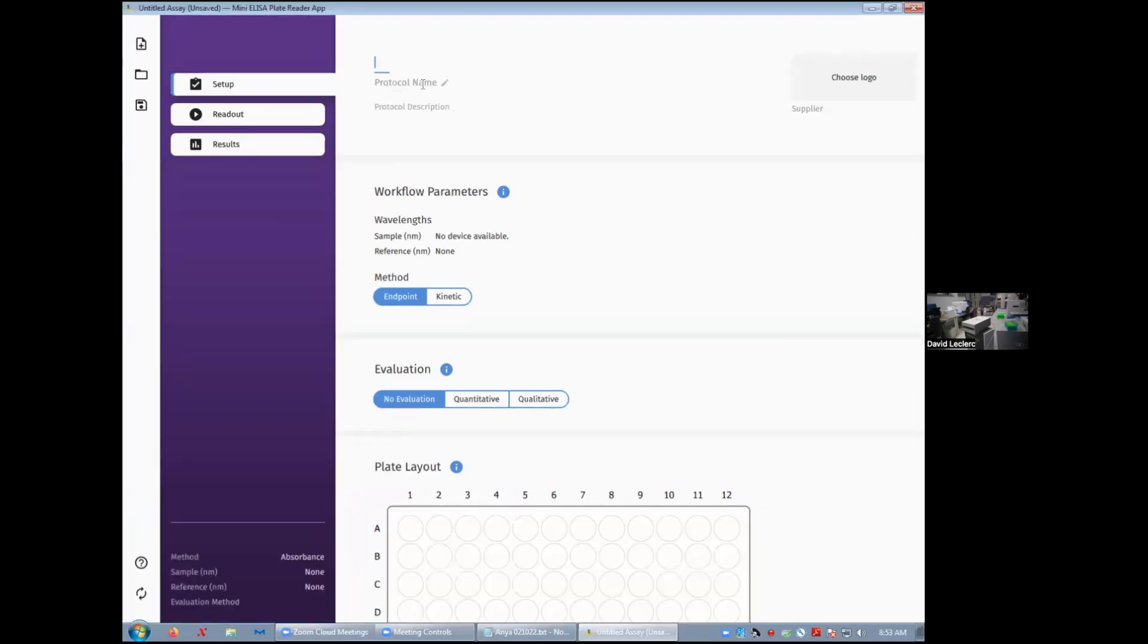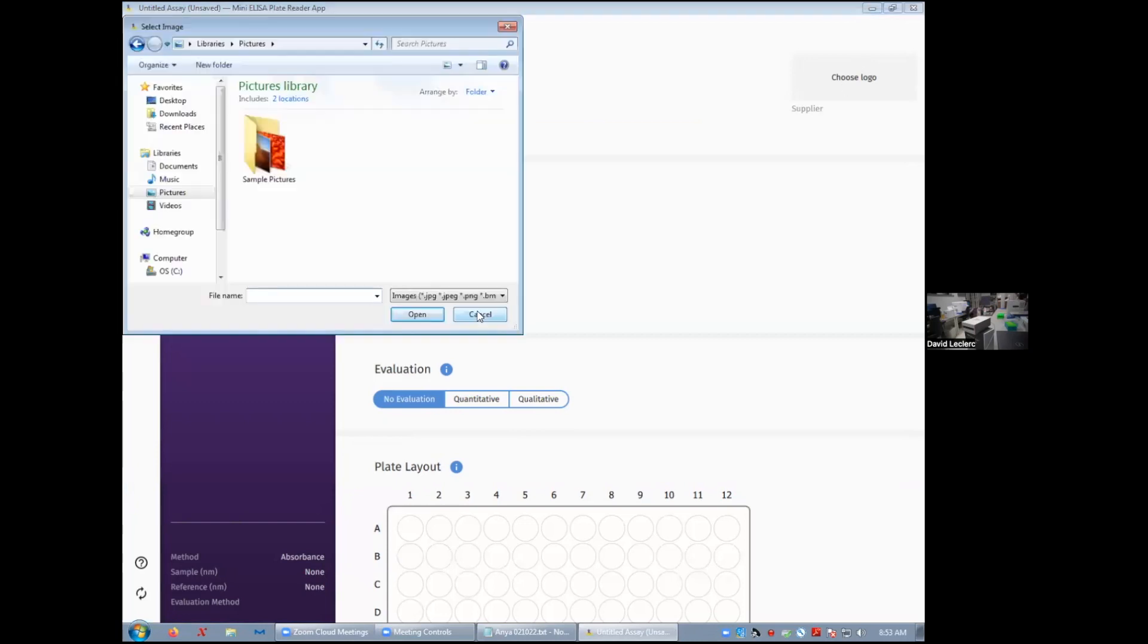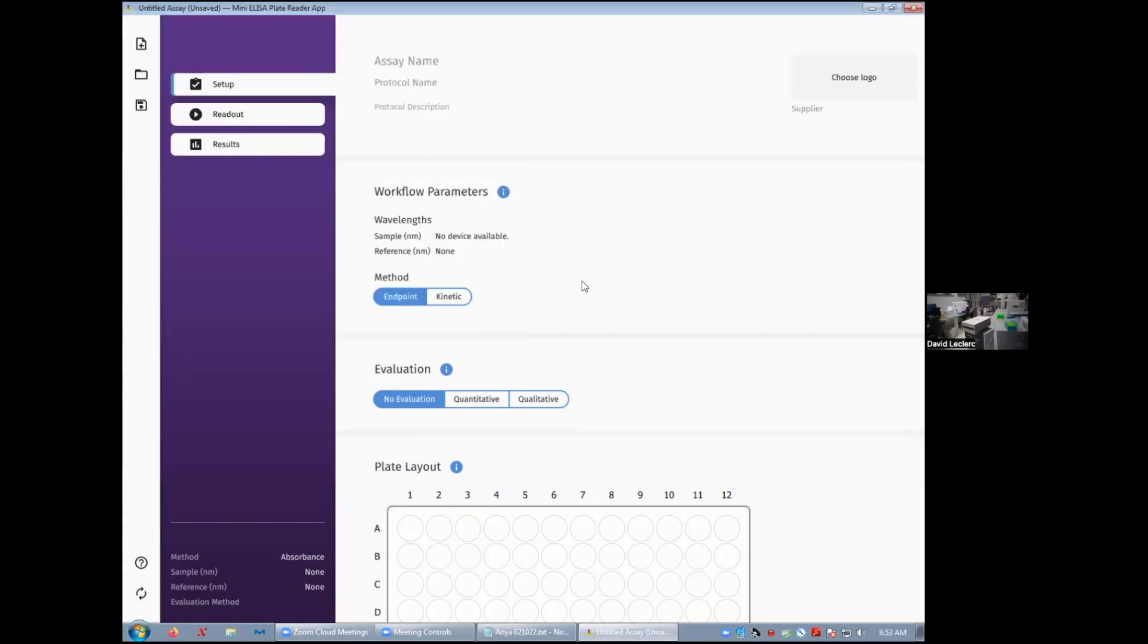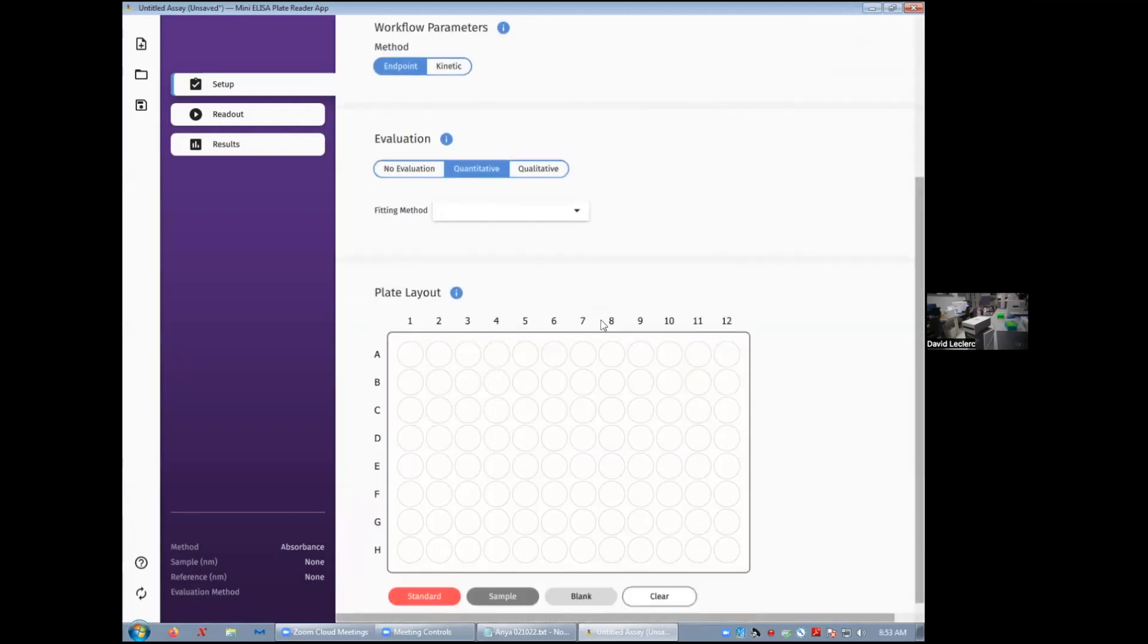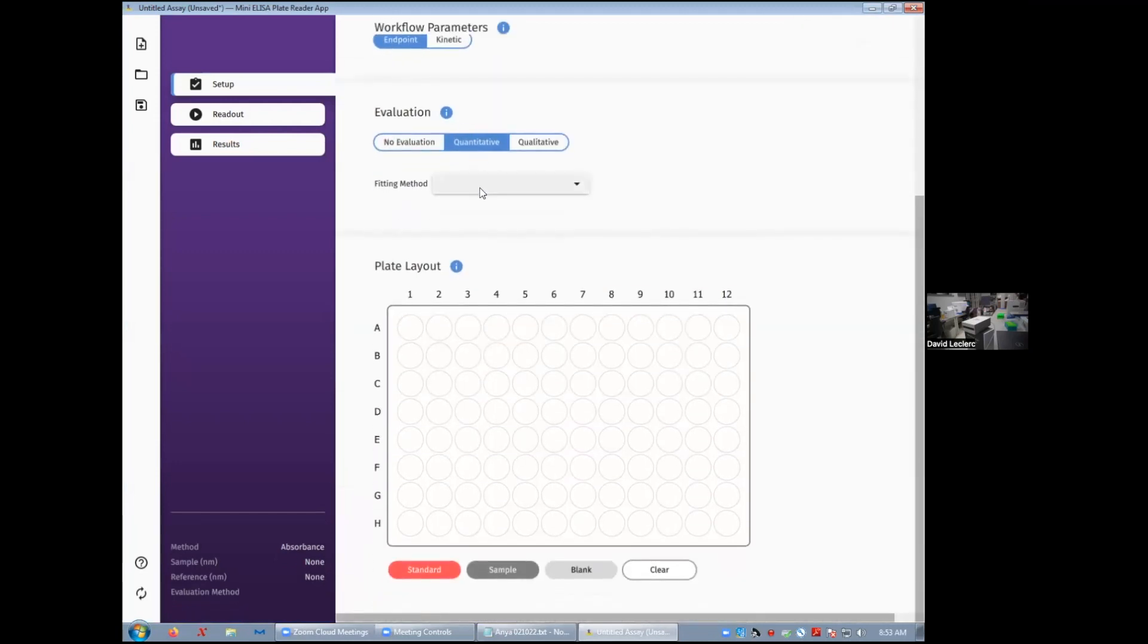You can give your assay a name, protocol a name, description. If you have a cool logo you'd like to use, you can do that here. Decide on your method of reading, so endpoint or kinetic. Decide on your evaluation method, typically it's going to be quantitative, and so from there you decide your fitting method.